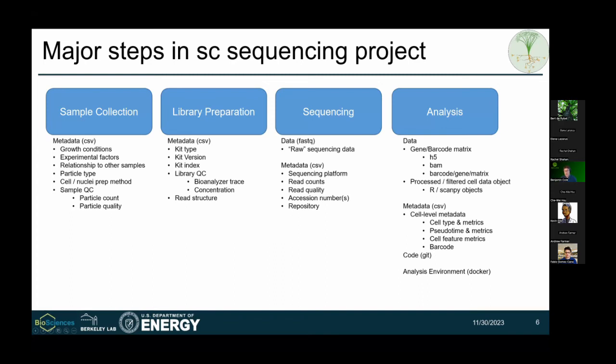Some pieces of software run differently depending on the architecture that they're run on. So it's important, it's helpful to have your analysis environment very well documented at the least. And I'd say one of the better things to do is use a container system like Docker, and I'll explain that in just a little bit.